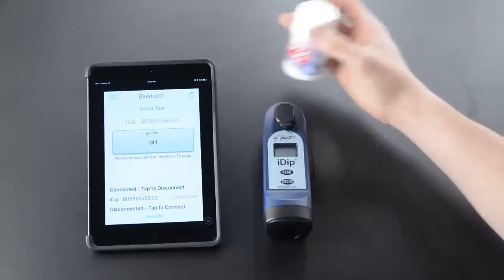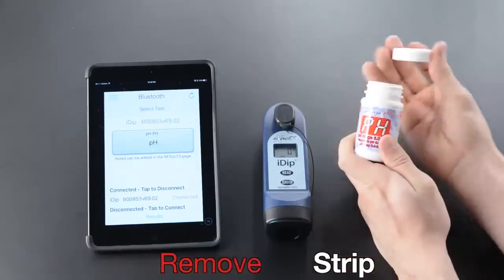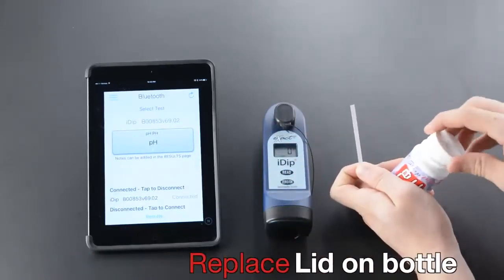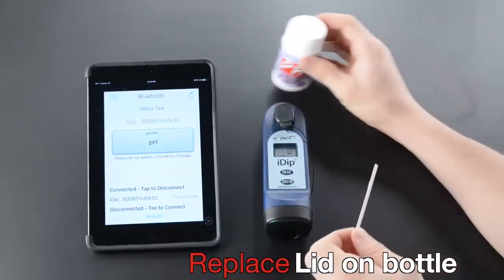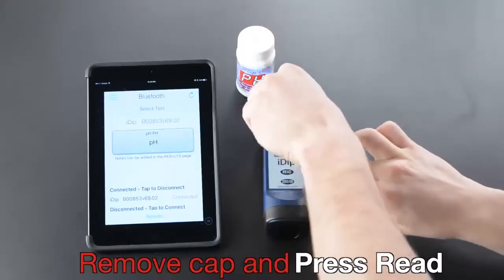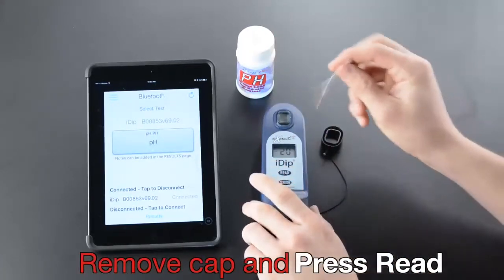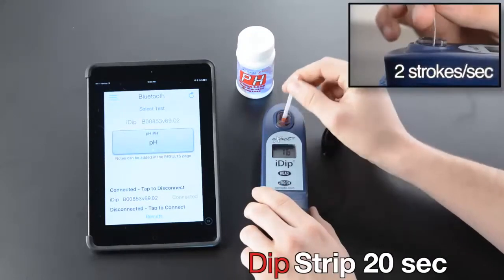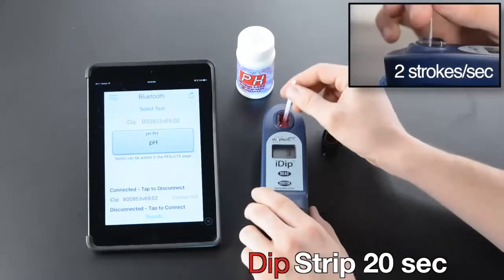Remove strip, replace lid on bottle, remove cap, and press Read. Dip strip for 20 seconds, two strokes per second.